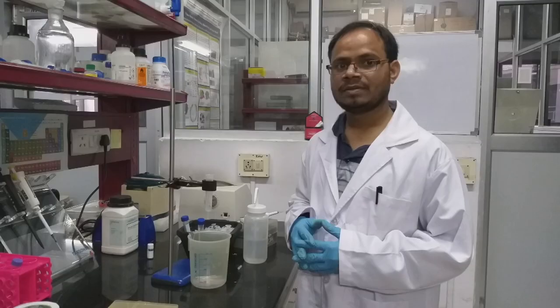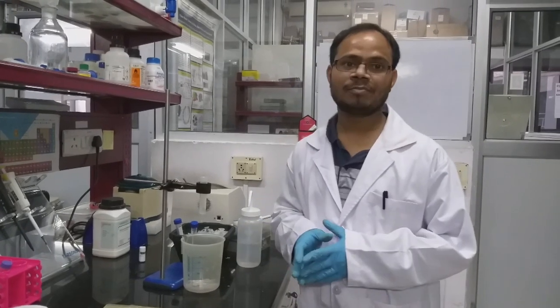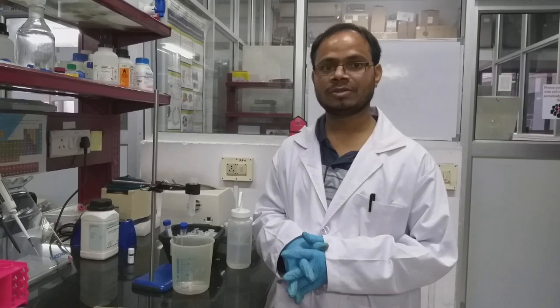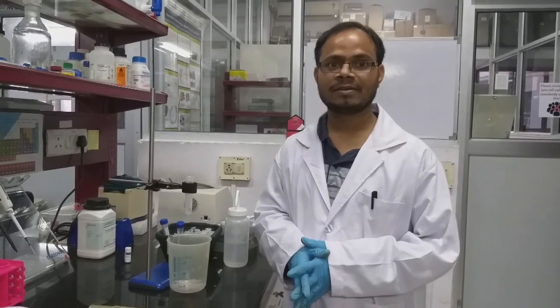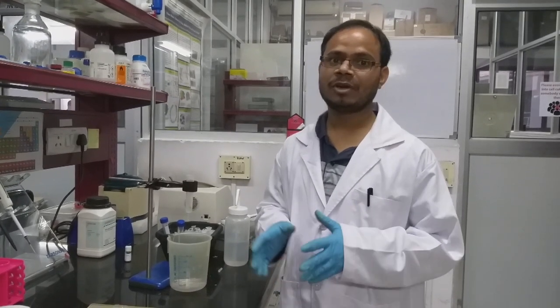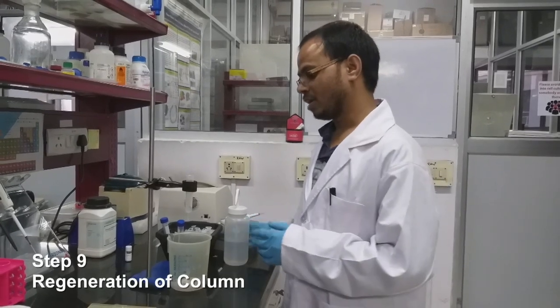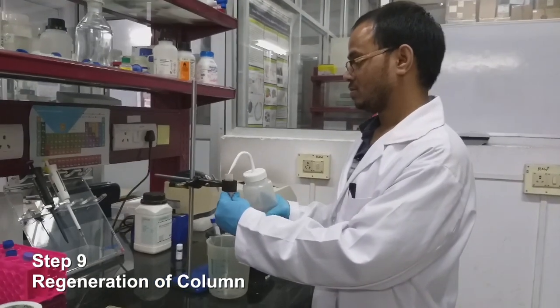After collecting the complete fractions, we have to wash the column with water, then 0.2 normal sodium hydroxide solution, then again water. After the final wash with water, we have to store the beads in 20% ethanol. So I will wash it and store it in the ethanol.